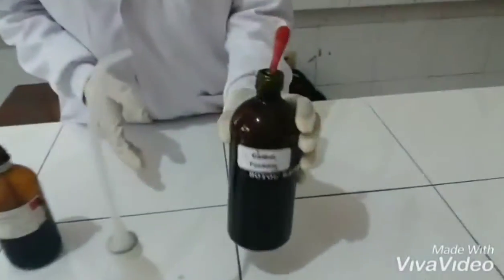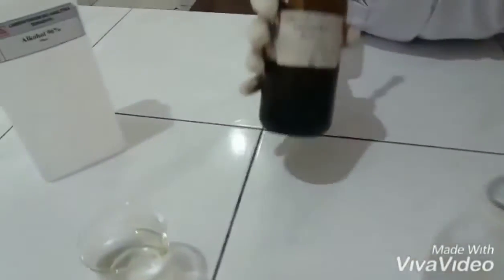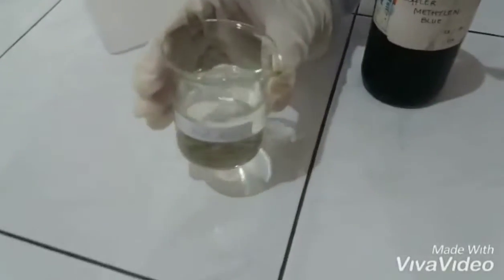For the Ziehl-Neelsen method, we need carbofuchsin solution, water to rinse, methylene blue solution, acid alcohol, and alcohol.